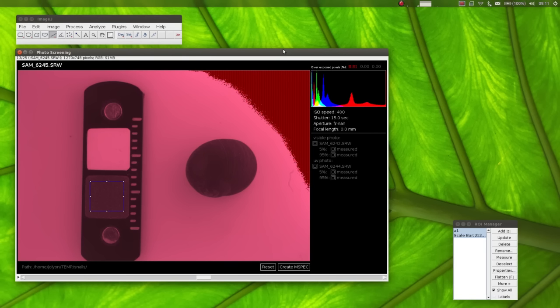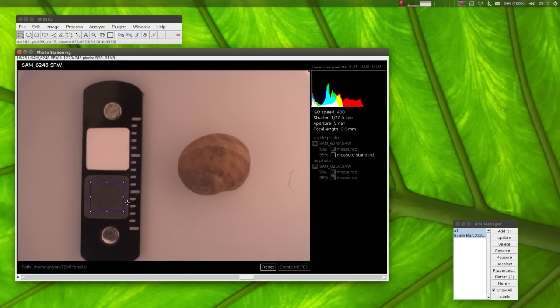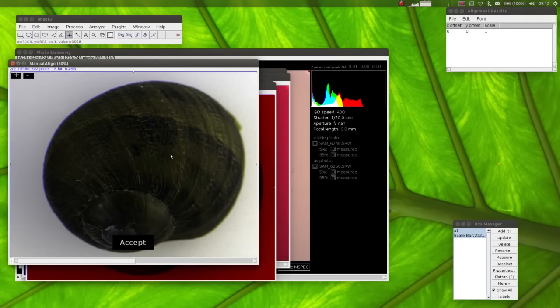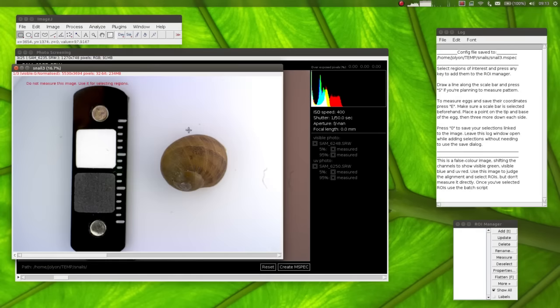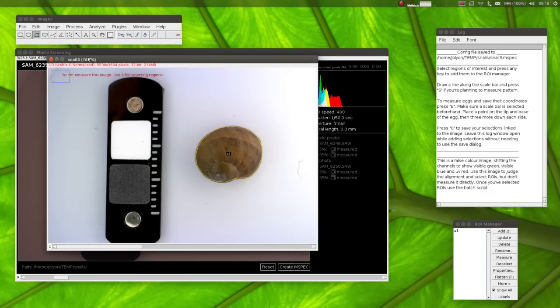Now we're back at the photo screening image. If you click reset, it will get rid of all of the options you chose and allow you to make a new image. So let's make the final snail shots. There we're done. Press 0 to save that and close.